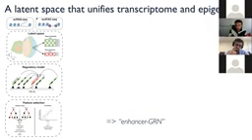This would work even better if you had multi-ome data, single cell multi-ome. This is a relatively new 10x kit that produces both from the same cell. And then we use a technique, again GENIE3, in fact, that was also used in the first step of SCENIC. But here we use it to predict which regions could regulate which target genes, basically using the covariability of the ATAC signal in a region with the gene expression of a nearby gene. And this allows us to go very far around each gene, in fly to 100 kb, so that would be 2 megabase in human, and link regions to target genes by this covariability.